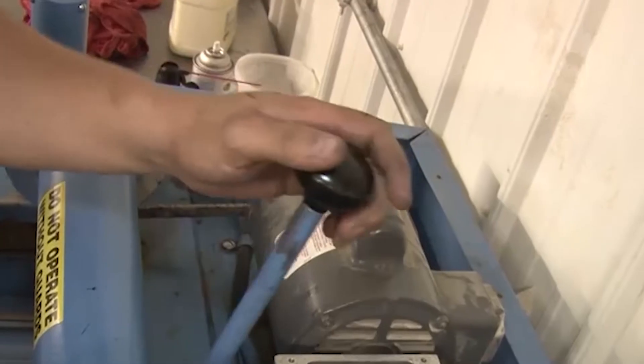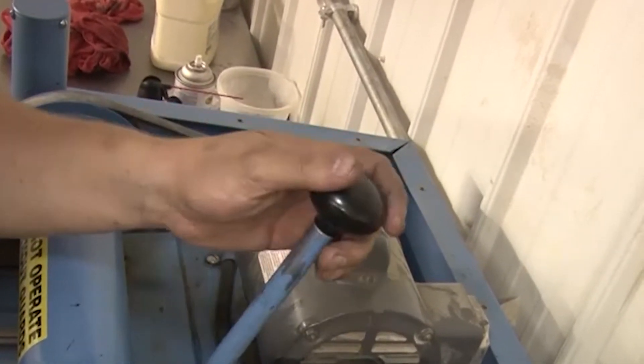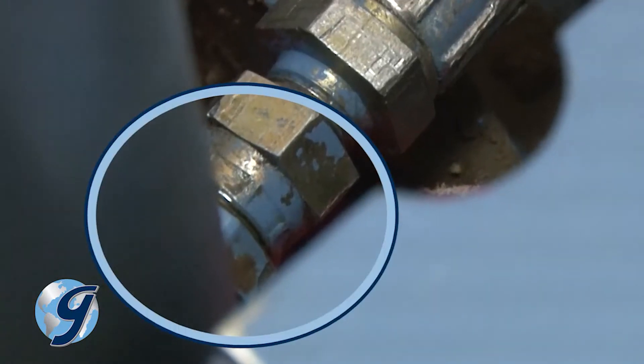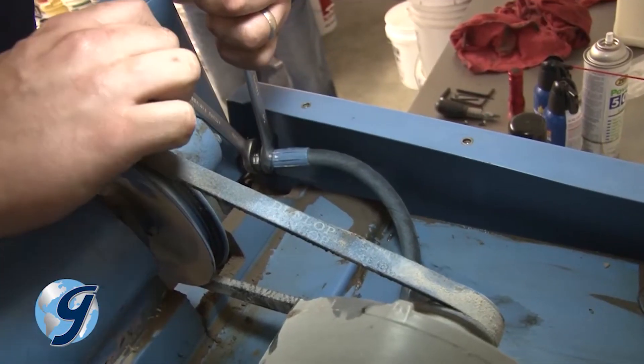Now bleed the hydraulic lines by working the handle on the pump as if you were clamping the screen trays. Observe the hoses at the cylinder fittings. As soon as fluid appears, tighten the fittings.